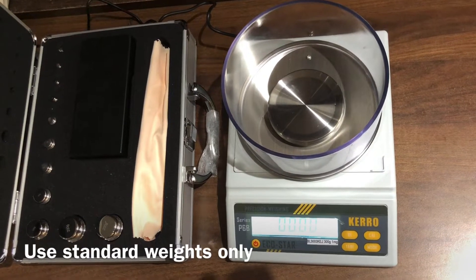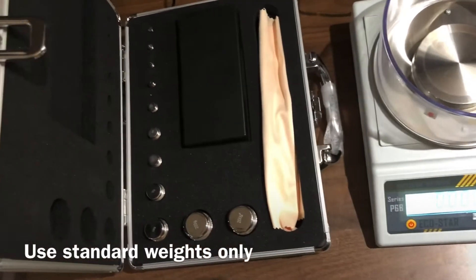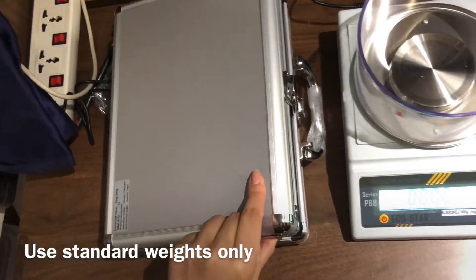This is a calibration video of Kero BLP6B series. We are using a standard SS weight box to perform the calibration.